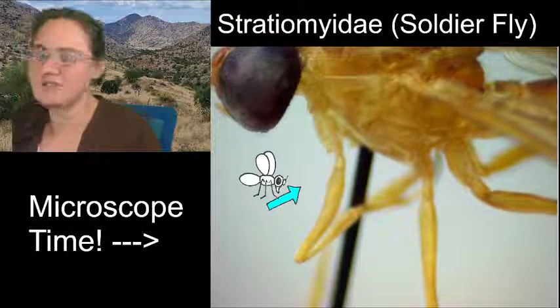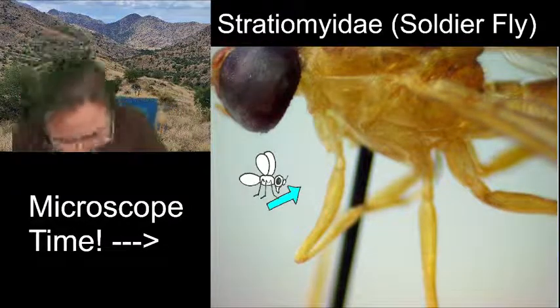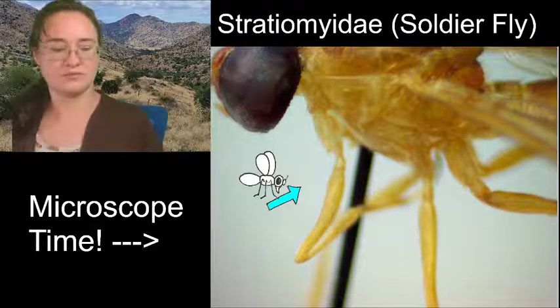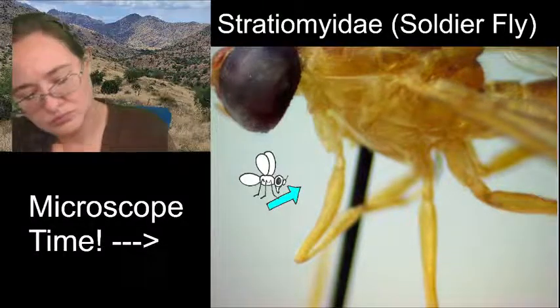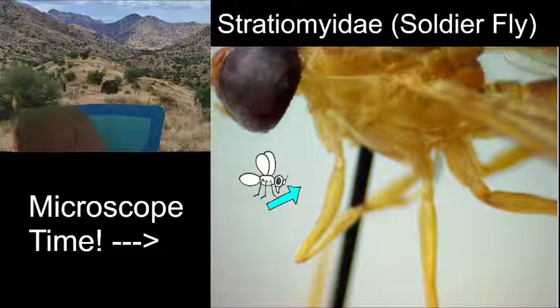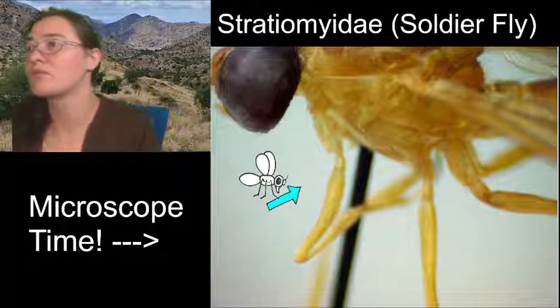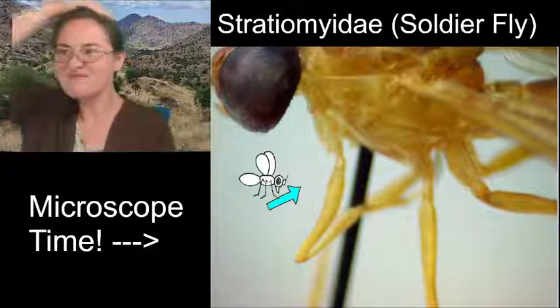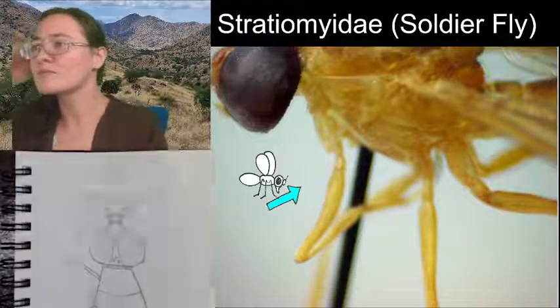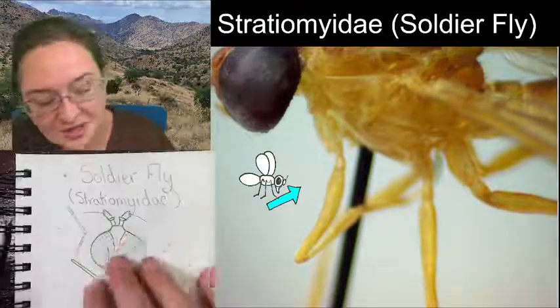So this is our femur. All right, this next one is our tibia.